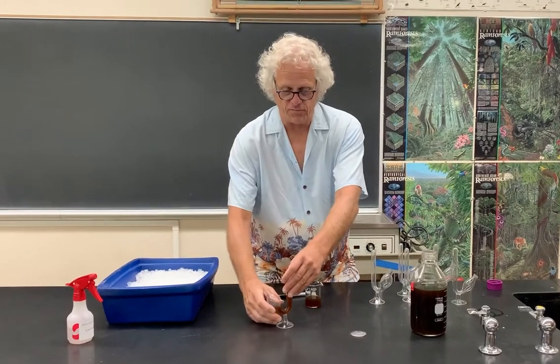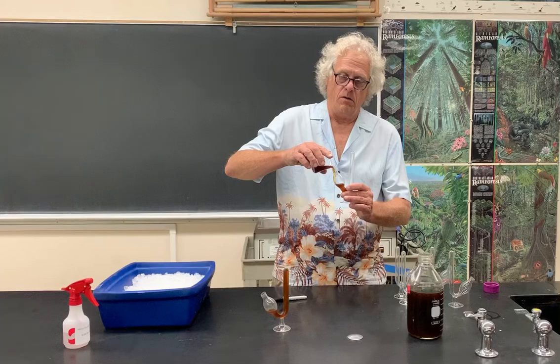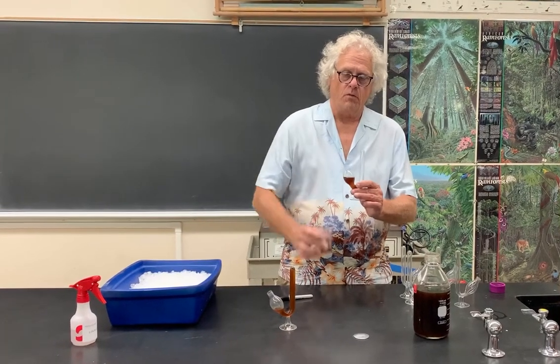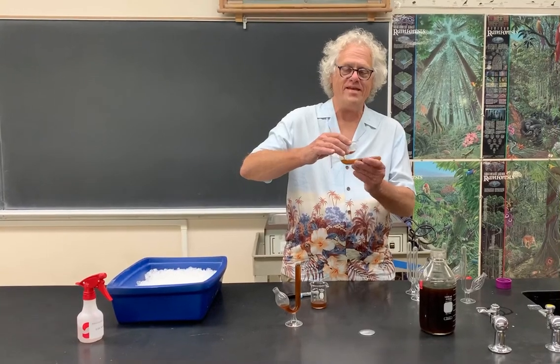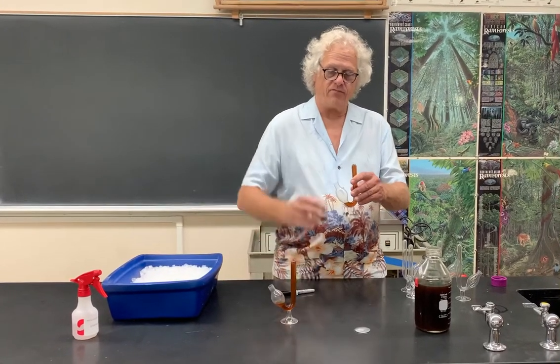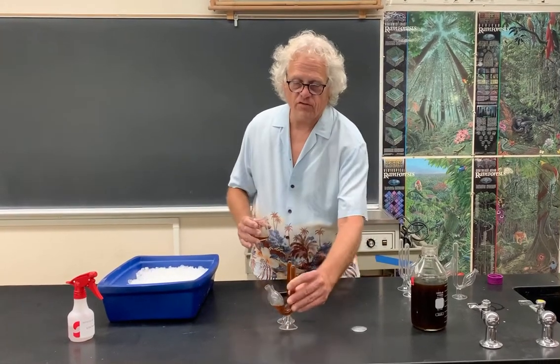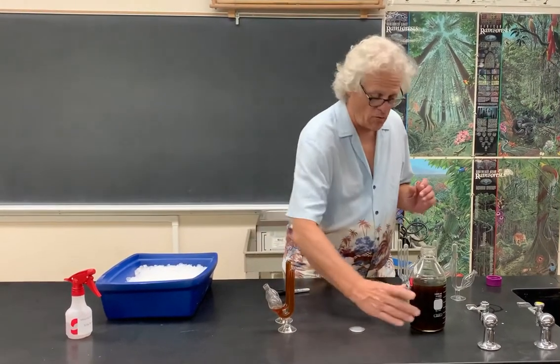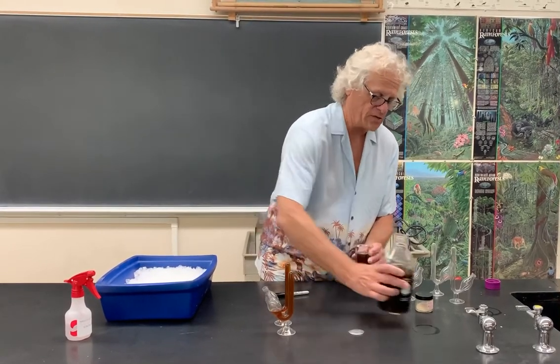I'm going to make 3 of them just like that. One for each one of those conditions. So this is a control. We're looking at the effect of temperature on gas production by yeast. So if we don't have any yeast in there, we wouldn't expect there to be any gas production at all. We should include that as a control in the experiment to make sure that is in fact true.